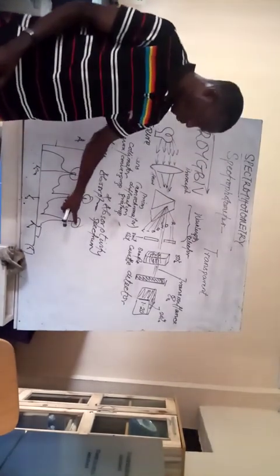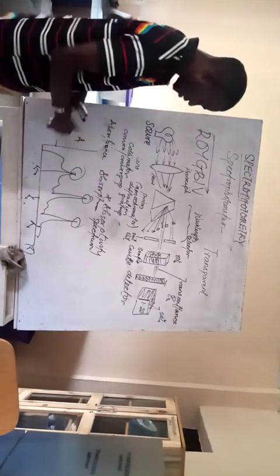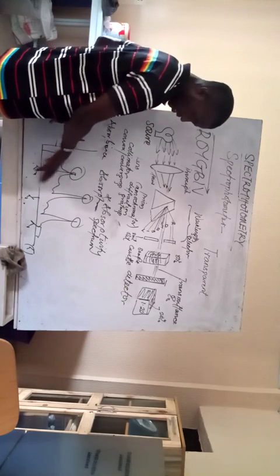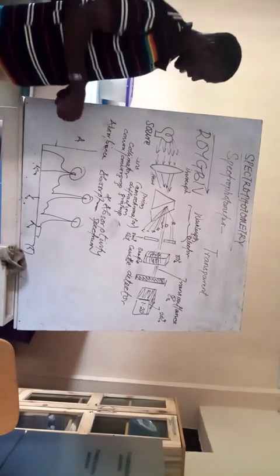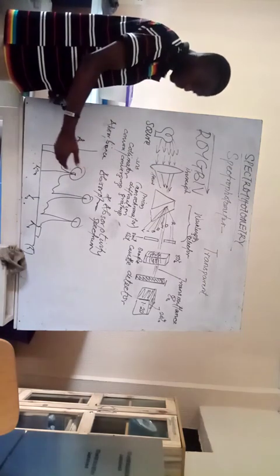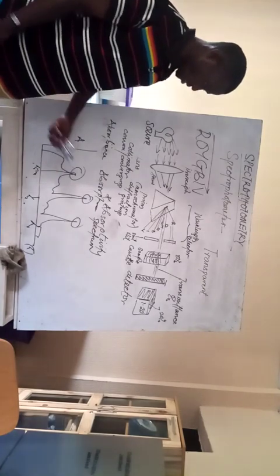The wavelengths at the peaks are the portions where the material absorbs much light, while the portions with low values are the wavelengths that the material does not absorb much. So setting your monochromator at different wavelengths of light is going to show different gradients like this, such that you can plot a graph like this, and then you're able to measure the absorptivity of the material.